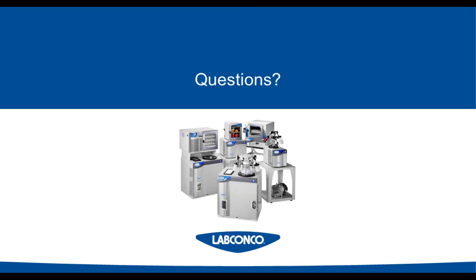Great, thank you. Now this question says, you said 0.2 millibar vacuum is required. Does this mean that the minimum 0.2 vacuum is required to start the freeze drying process? I hope that makes sense. Well, with our freeze dryers, you can choose what vacuum set point you want.